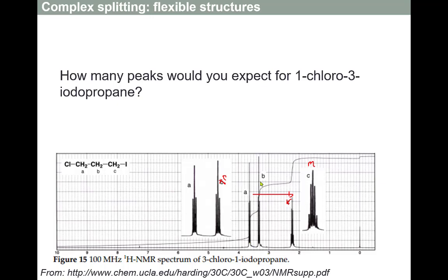So with that little change here in our labeling, I didn't notice this before we started the video. There we go. We have our 2 halogen adjacent signals that are shifted quite a bit. We've got our central signal that's shifted less so. And the splitting makes sense.